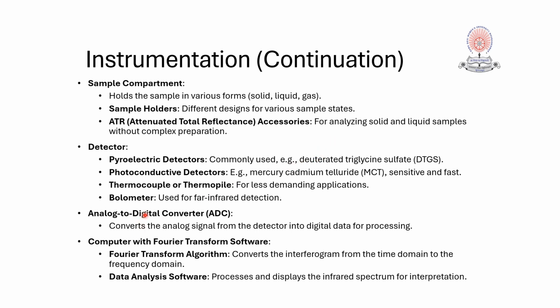There are different types of detector like pyroelectric, photoconductive, thermocouple or thermopile, and bolometer. For near infrared region, lead sulfide and photoconductive detectors are used.